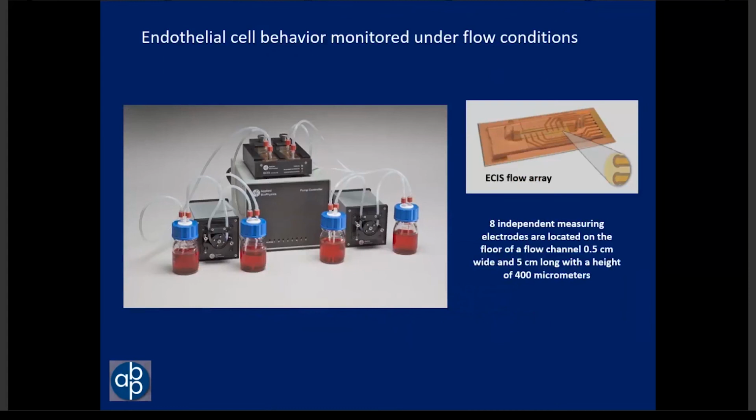It's possible also to monitor endothelial cells under flow conditions, their flow arrays, and one can actually wound the cells in these flow situations, which is very interesting, and study how fast cells migrate under flow, similar to that of the shear stress that these cells would see in vivo.